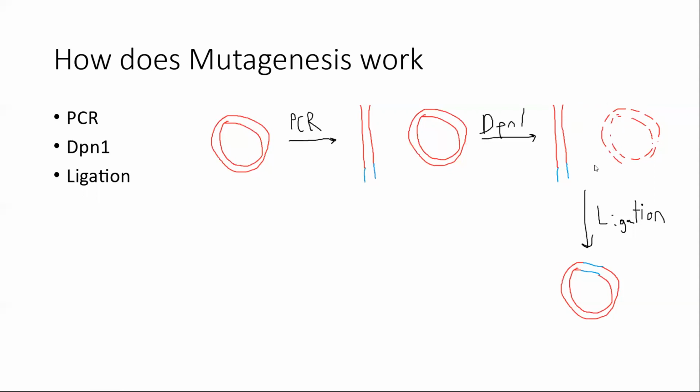If you ligate too long, it may be able to reform into something, but most likely it's just going to reform into linear, non-circular DNA, which will then not be expressed in E. coli systems. One way you can look at the efficiency of a ligation is to use some kind of colorimetric expression site, such as a LacZ promoter, which will allow you to do blue-white screening.